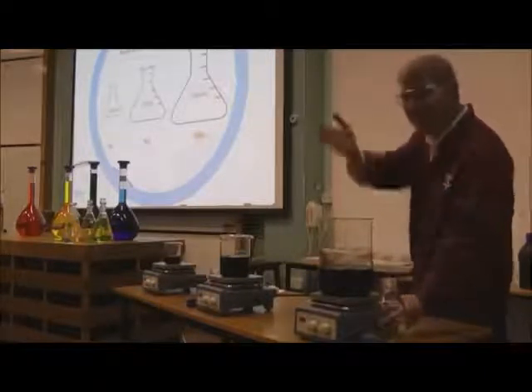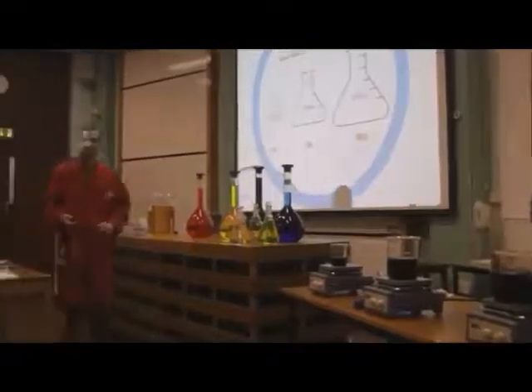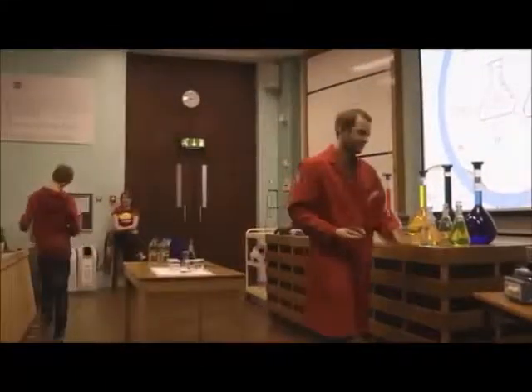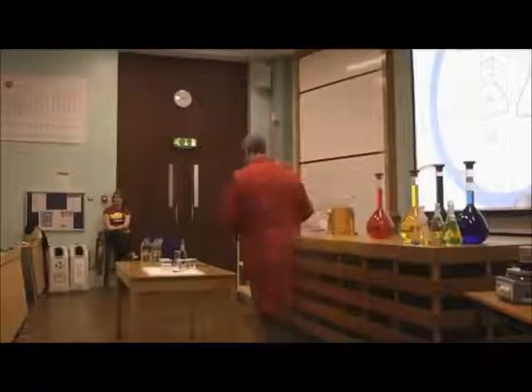Okay, brilliant. Very well done, the volunteers. Put the glasses back. Congratulations to our person who said it was all the same. You were a minority in that audience, or you were the only one with the confidence to shout.